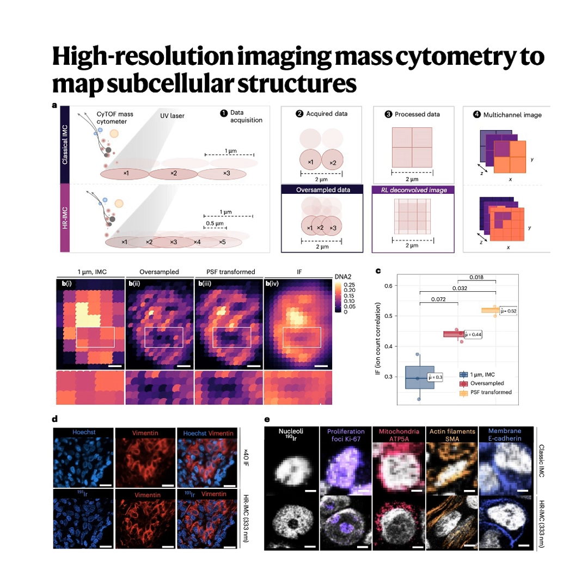And this is where our focus enters. High-Resolution IMC, or HR-IMC. They cracked this using pure computational smarts, achieving resolution below 350 nanometers. It's incredible. Okay, let's unpack the mechanism. This truly feels like computational magic. It really is a phenomenal example of engineering around a physical limitation. I mean, physically shrinking the laser spot to submicrometer sizes is really, really difficult. Oh, why is that? You lose laser stability, you lose tissue penetration depth, and you start to introduce thermal degradation. You're basically cooking the sample. Not ideal.